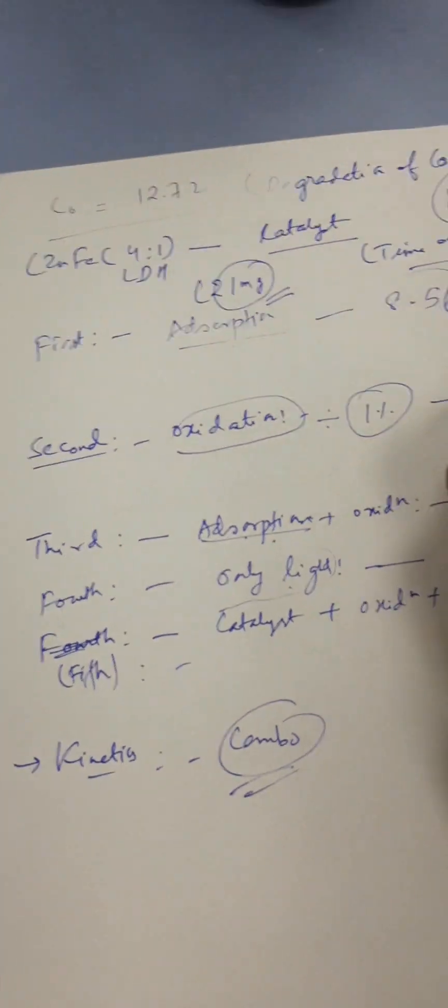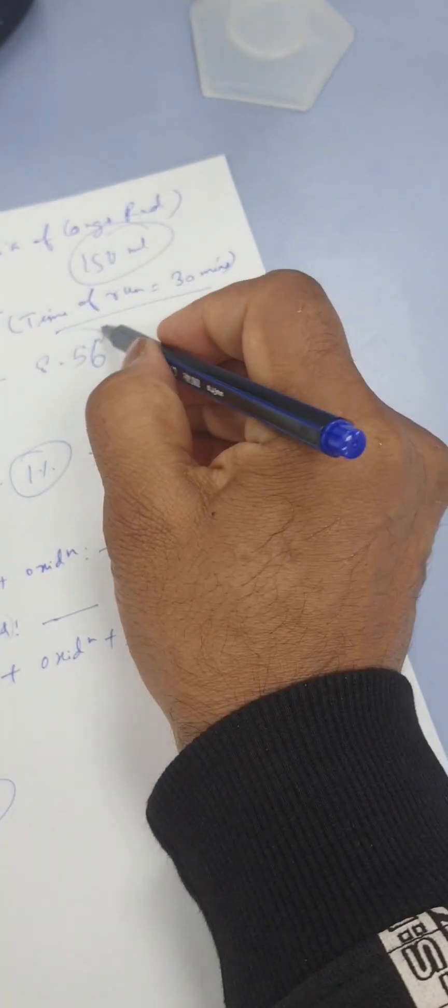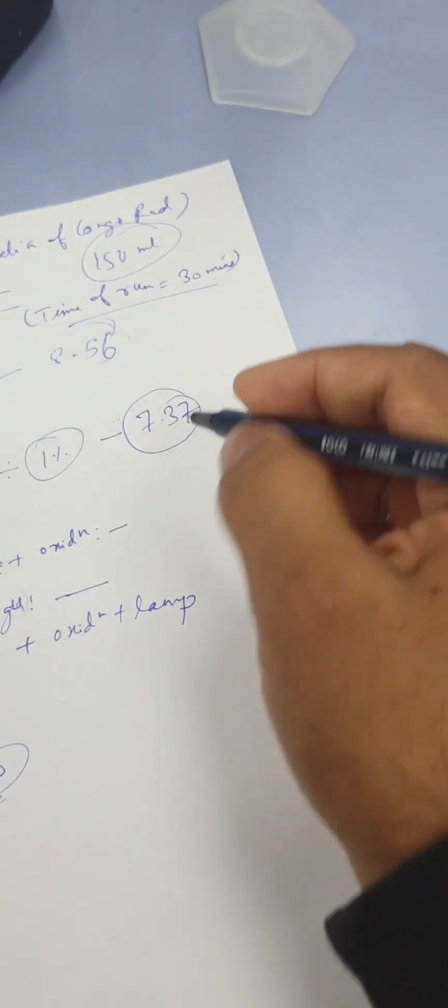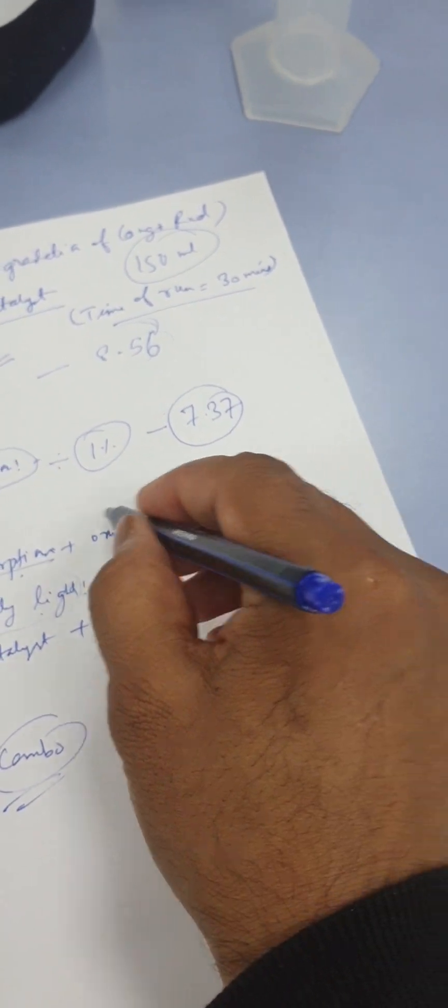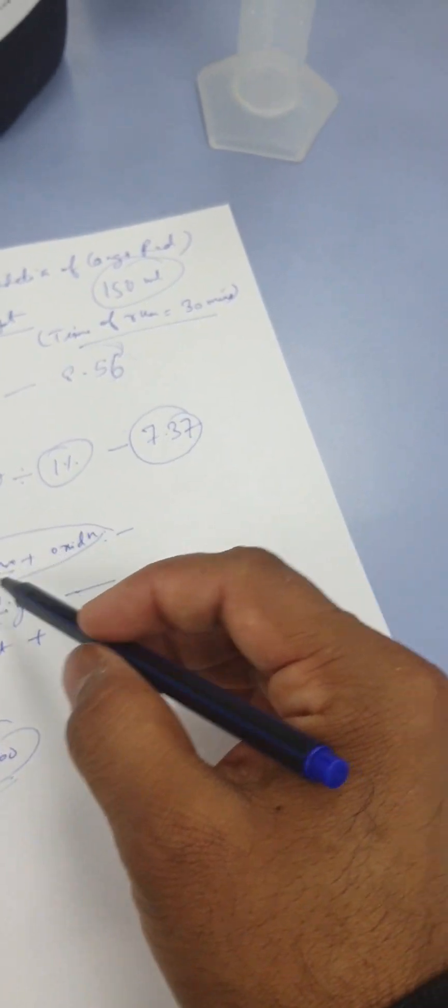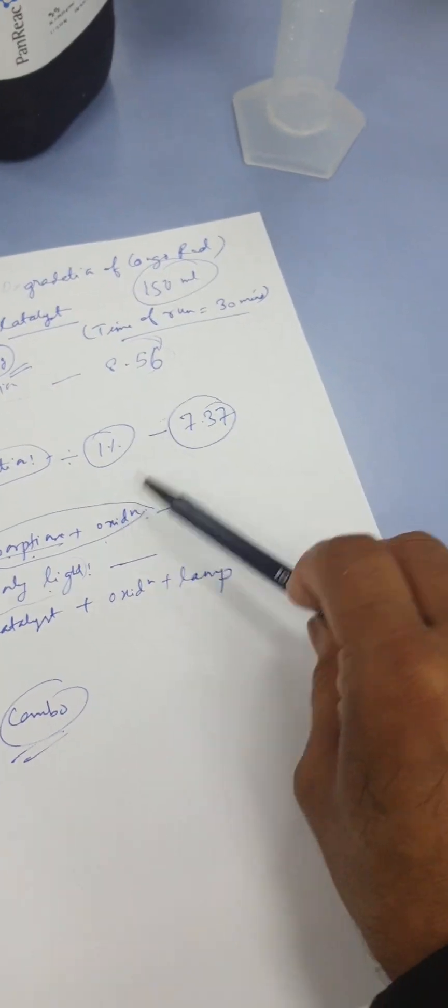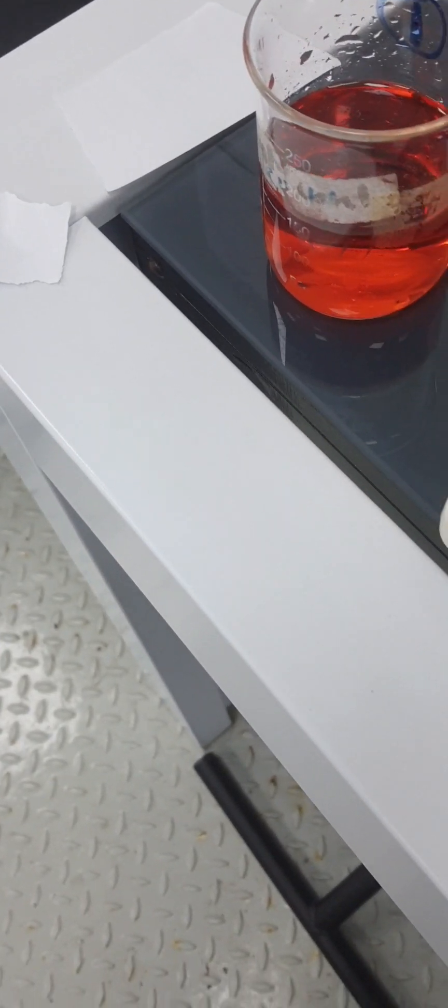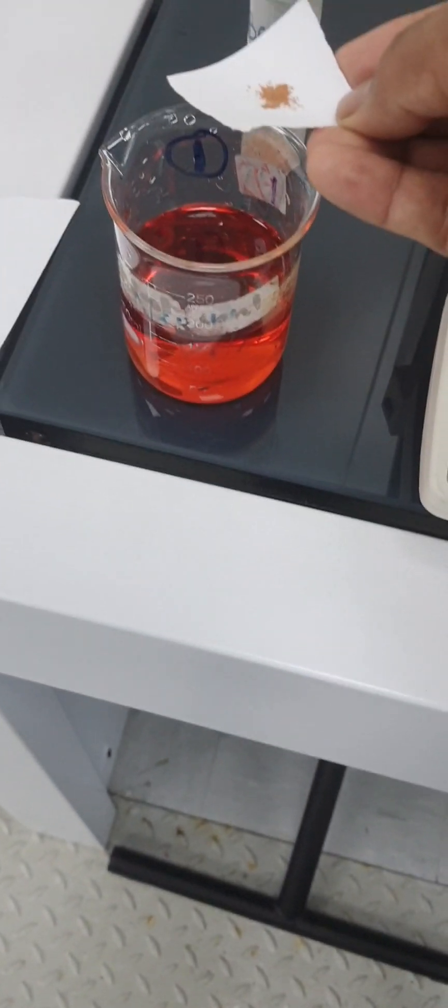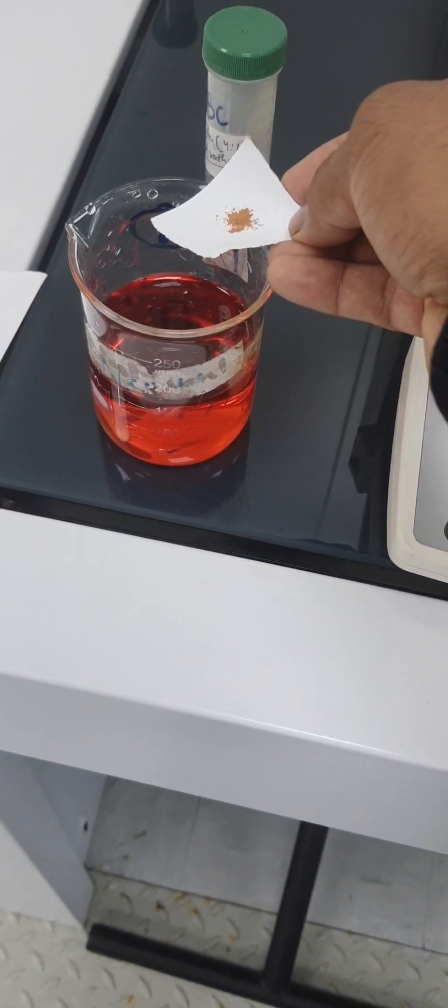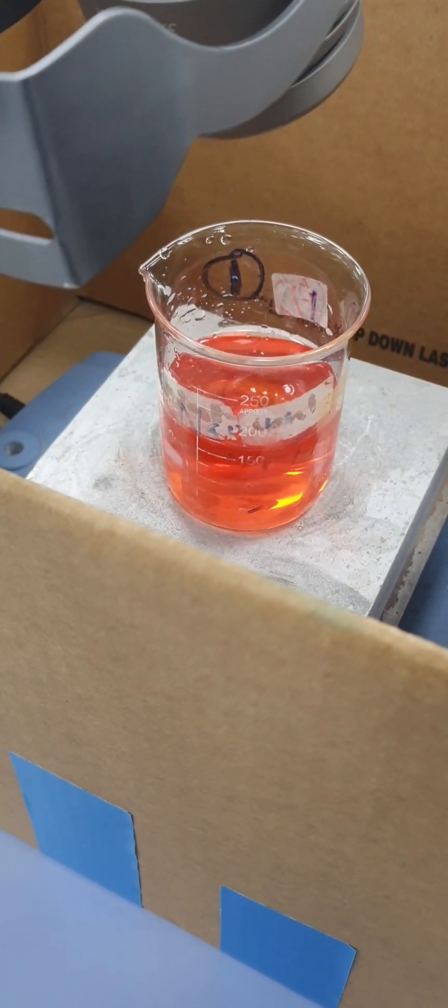In the first case it was around 8.56, this is 7.37. Now let's do the combo. Combo means two processes which is adsorption plus oxidation. Here I'm adding the same amount of adsorbent or you can say the catalyst, the zinc iron LDH. Again we will shake the whole assortment or mixture for half an hour and check the final concentration.